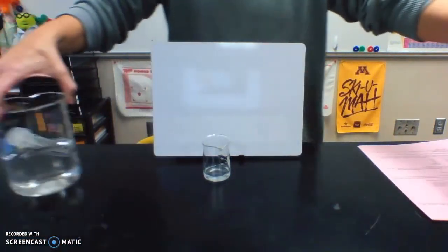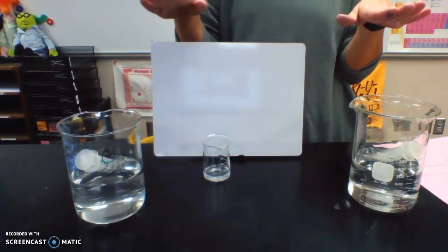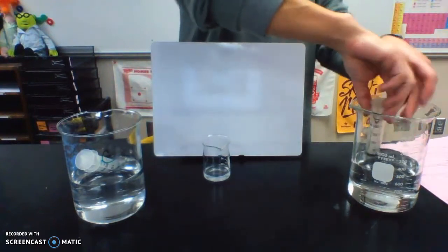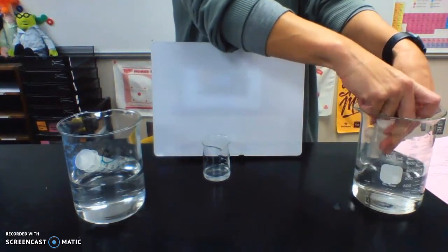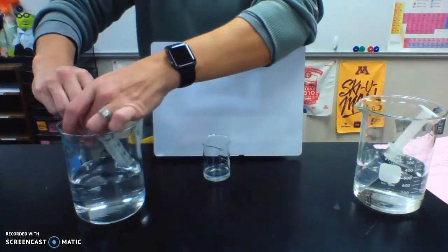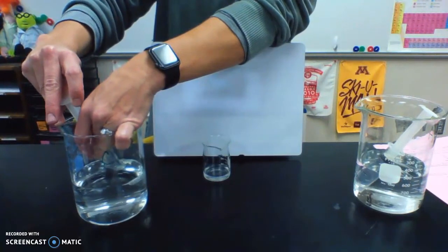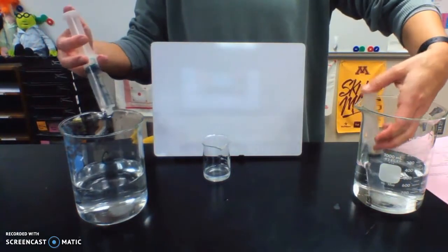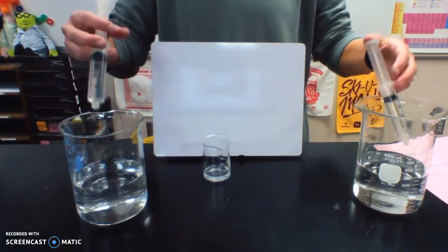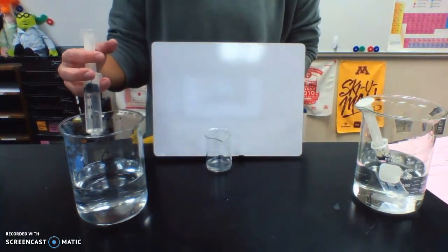We're going to do this with different concentrations. The first one is our standard solution. So we've got 10 of B, and then I'm going to add 20 of A and 20 of C. I'm going to add these at the same time. When I start adding them is when you can start your stopwatch. And this doesn't work if it's not in front of the white background.